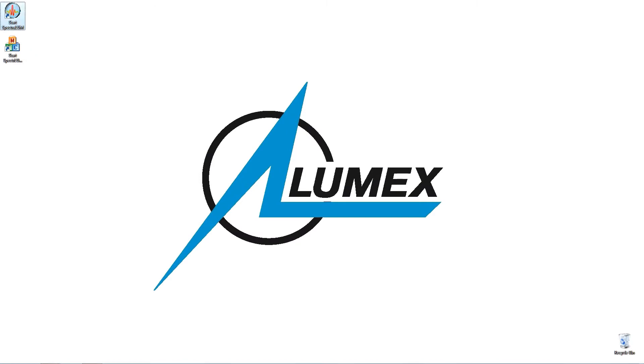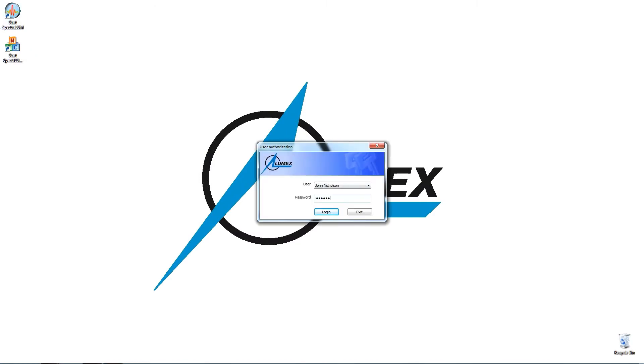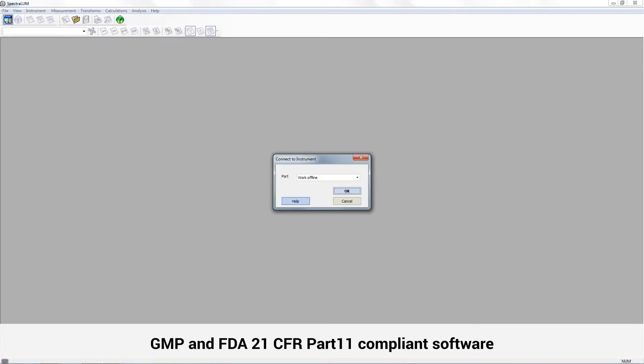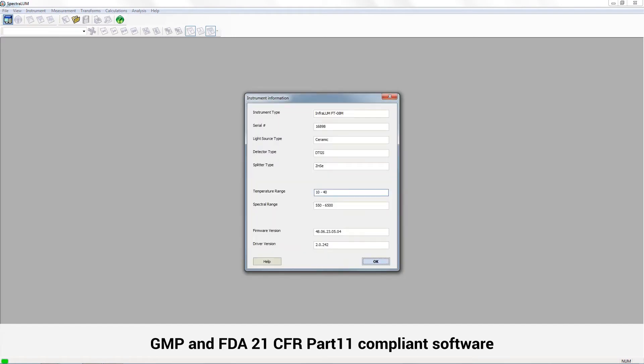Now, let us take a look at the Infralume FT08 software, Spectralume. It is designed in-house by Lumex Instruments and complies with the corresponding GMP and FDA guidelines.